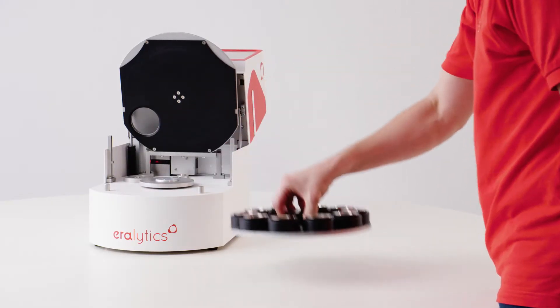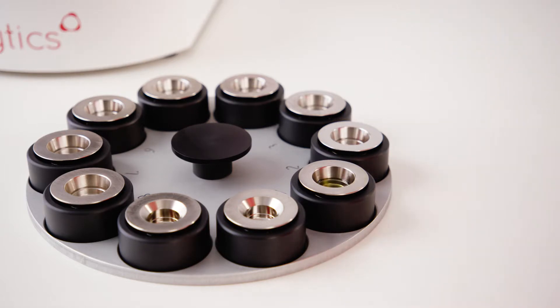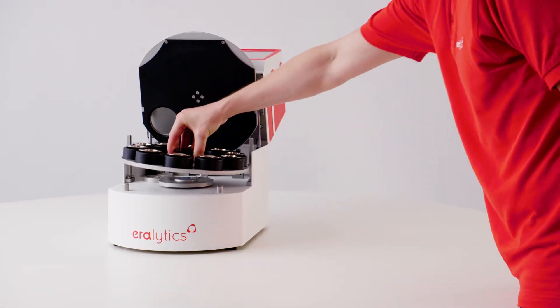Method and measurement parameters can be specified individually for each position. Remove the carousel from the instrument, fill the sample cups, and add a stirring magnet. Afterward, re-insert the carousel.